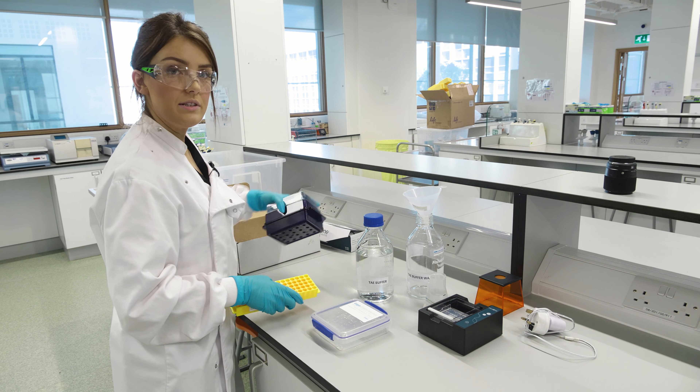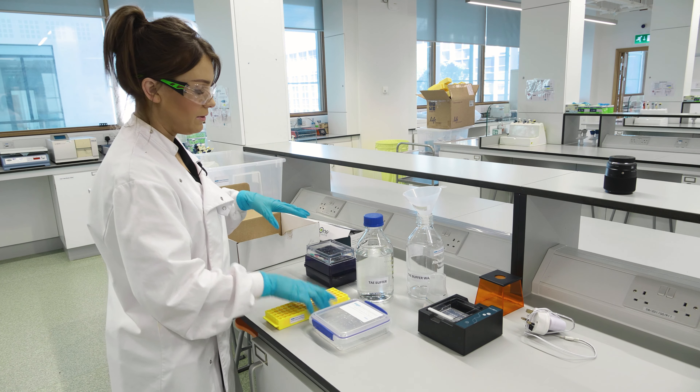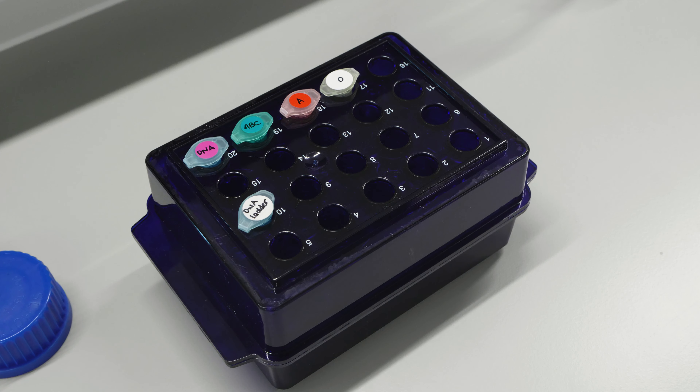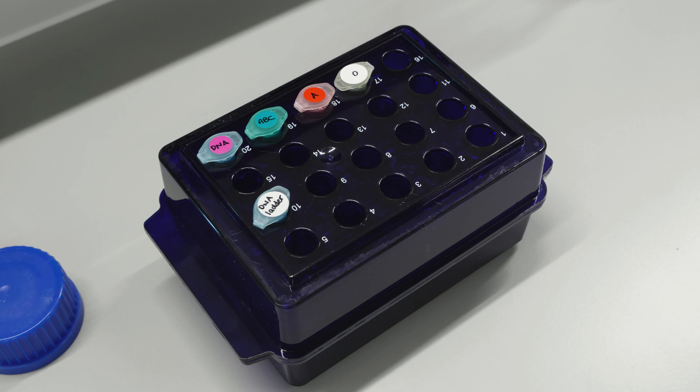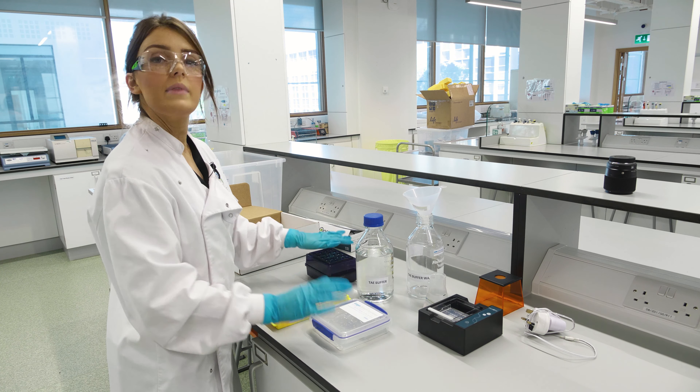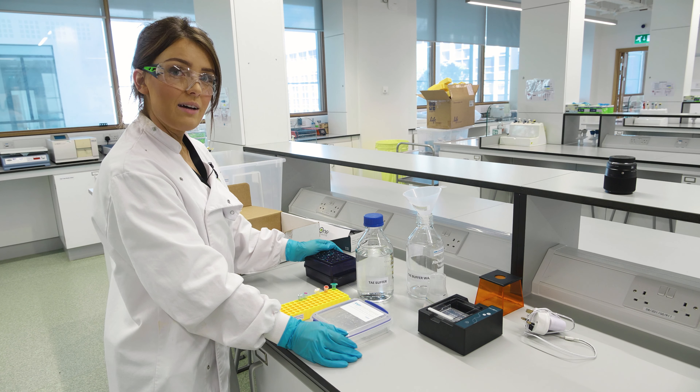When the students are using their DNA samples, you can give them the micro tube racks. The DNA ladder will also be provided. That's the unboxing of Lab 3 — good luck with your lab.